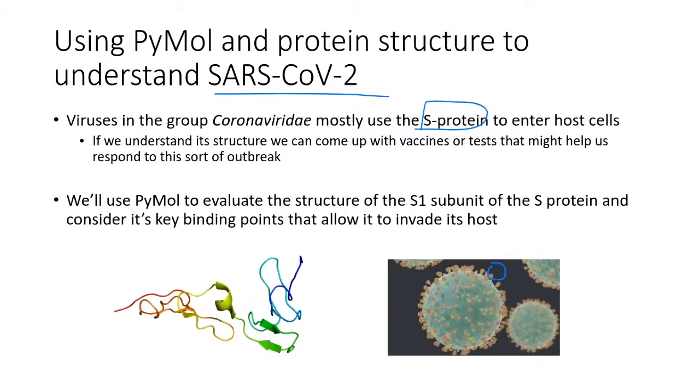All right, there will be a couple of questions. It's not only step-by-step instruction. There are no questions like in MEGA that you have to type, but there are things like label this and label that. And from the image that you generate, I will understand if you understood the question.